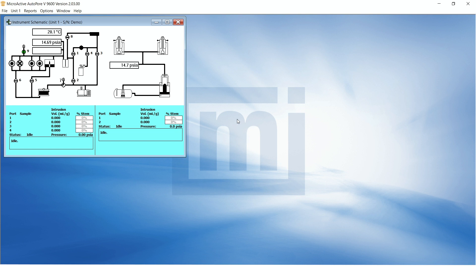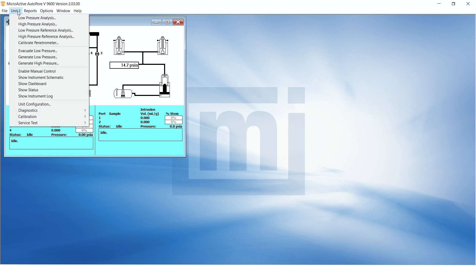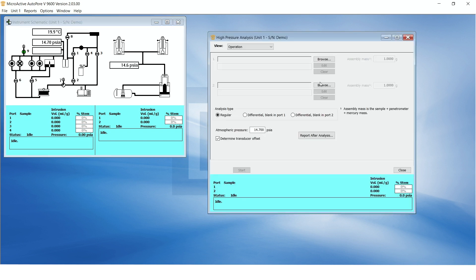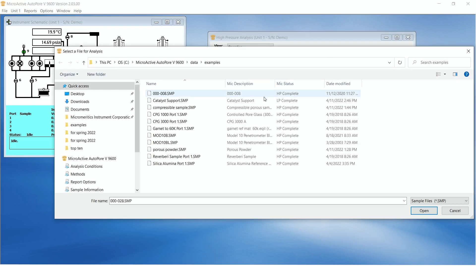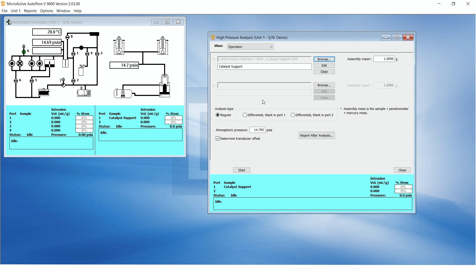Now we move back to the computer. High-pressure analysis is selected from the unit menu. We select the same sample information file and assign it to the high-pressure port one.